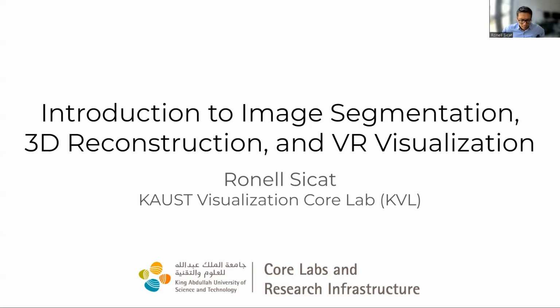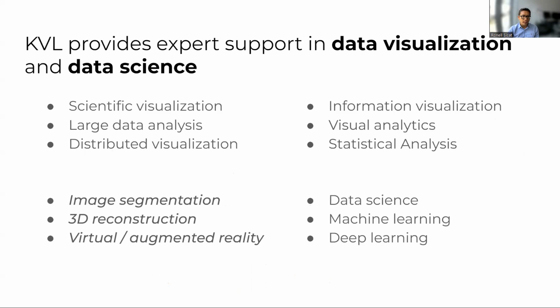So yeah, KAUST Visualization Core Lab, or KVL, is a part of the KAUST Core Labs and the research infrastructure. In KVL, we provide expert support in data visualization and data science. I listed here a bunch of the topics that we cover in KVL, and the focus for today is the topics here in the lower left.